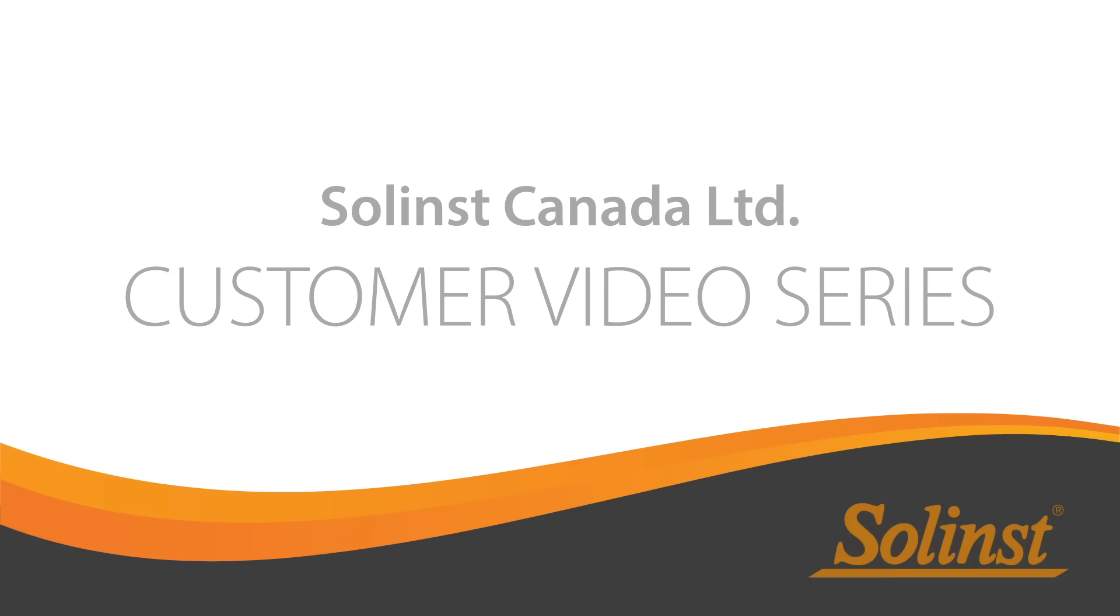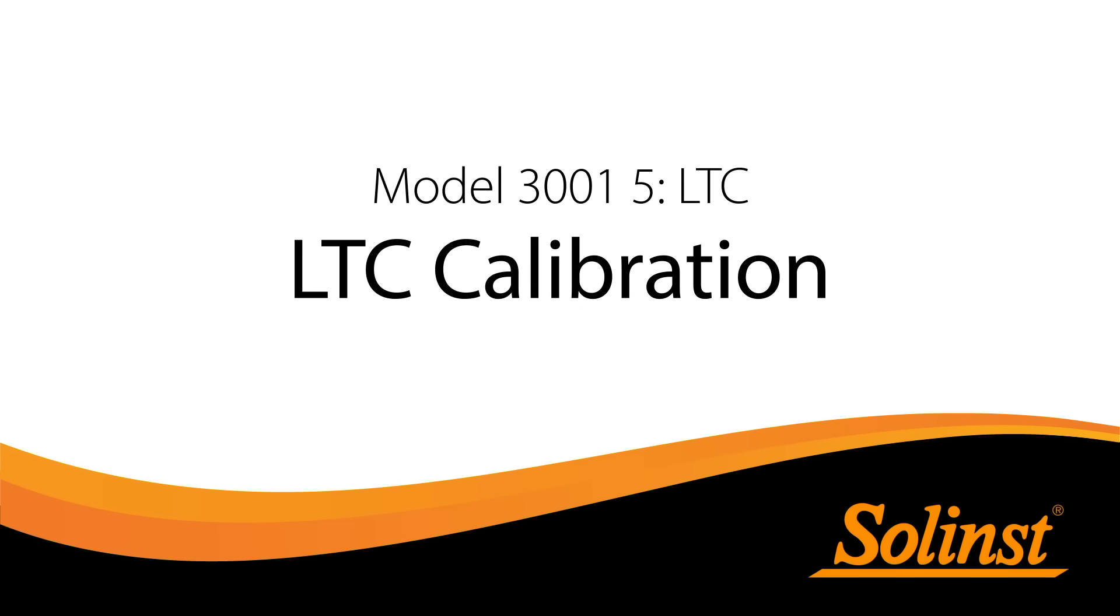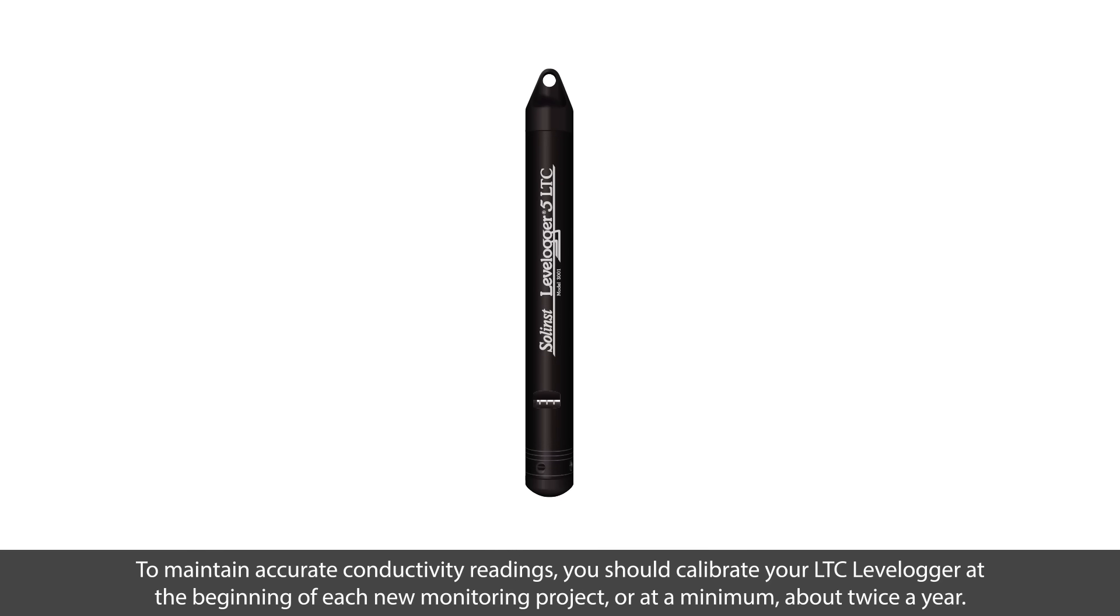Welcome to the LevelLogger 5 LTC calibration video. Before we start, it's important to note that in order to maintain accurate conductivity readings, you should calibrate your LTC LevelLogger at the beginning of each new monitoring project, or at a minimum about twice a year.